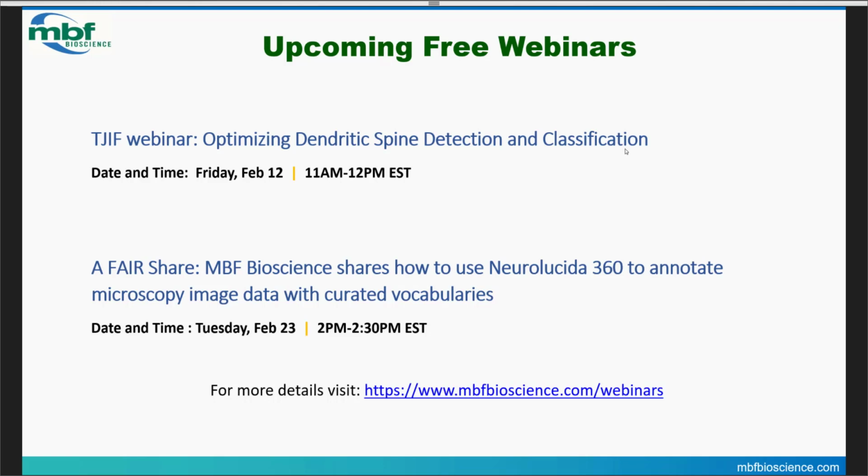It's fairly flexible in terms of the modalities that can be used for that 2-photon, which is somewhat surprising, because the brightness, for instance, of the cortex is very different, and the difference between white matter and gray matter in the 2-photon is very different than what we see in Nissl. Yet the program that Brian's written does a pretty good job of accommodating those differences. So even though we use this average Nissl brain, there's quite a bit of flexibility.